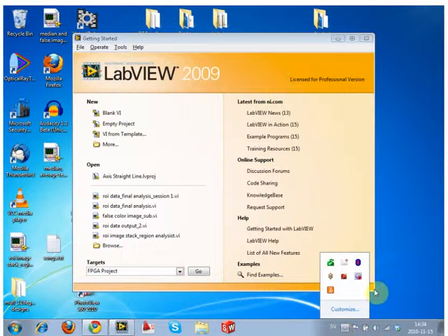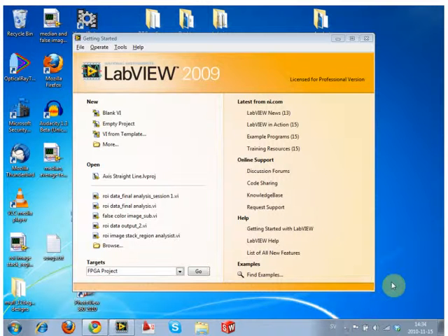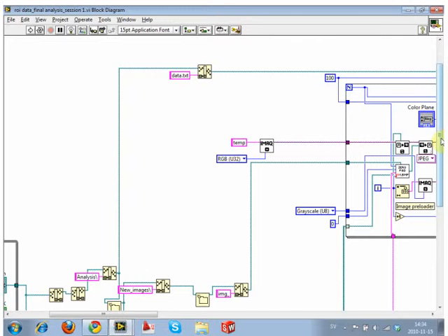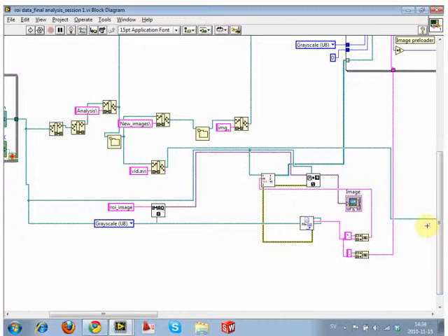I didn't really get this part of it. For me, my extension is JPEG, so I don't understand this part. Right, but how does the program know your extension's JPEG? Okay, we're telling it to store. We're telling it to filter these files.